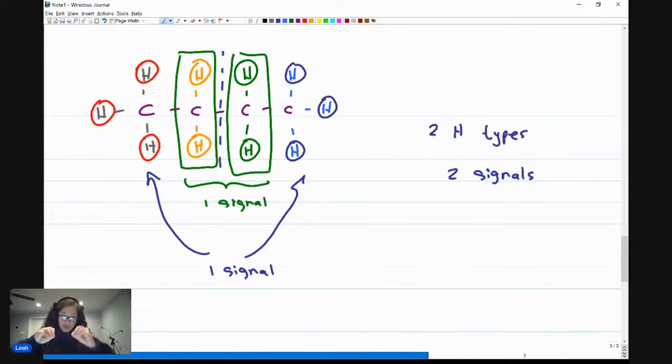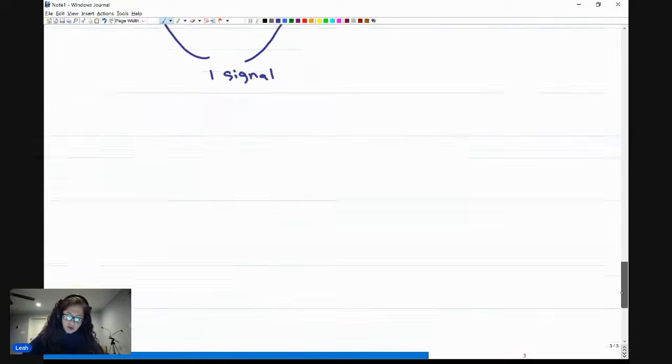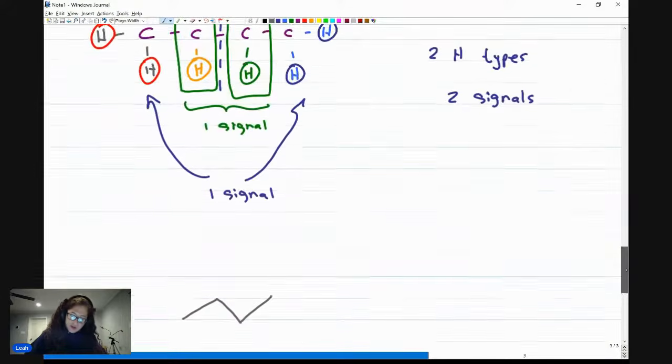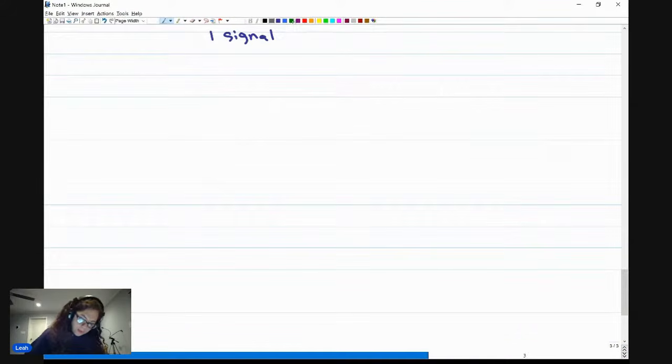If you're with me here so far, put "harder" in the comments and we'll crank it up a notch by doing two things. First, you're not going to get your molecules this cleanly written out with all the hydrogens visible. You're going to get something more like this. Line structure, and now you're told find the hydrogen type. So let's not make it as difficult yet. Let's look at this right here, which you'll notice is the same thing as what I have here, but suddenly it's less obvious. Let's make it bigger.